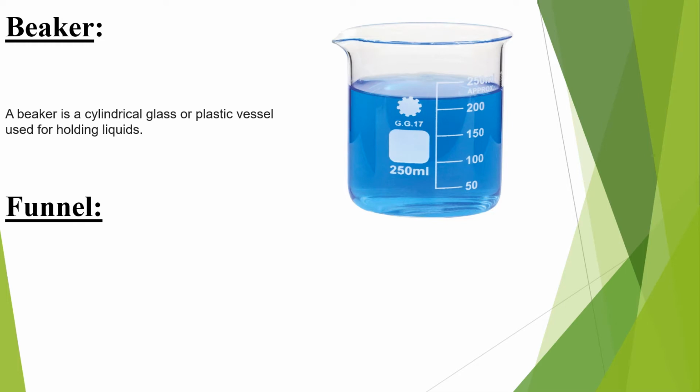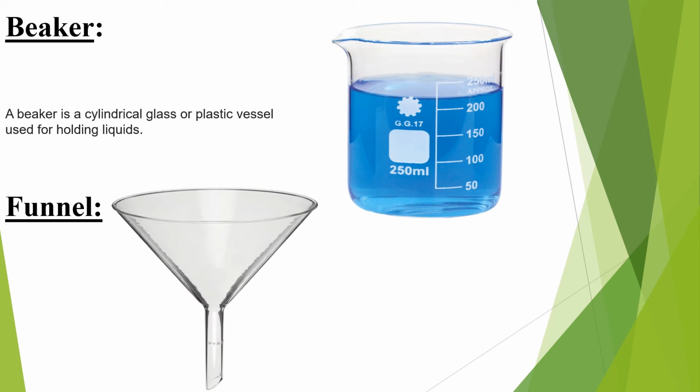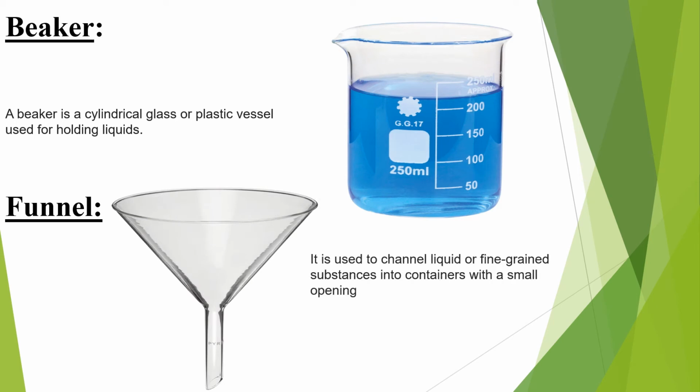Next, funnel. This is funnel and it is used to channel liquid or fine grained substances into containers with a small opening.